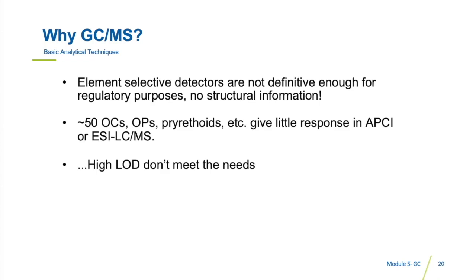Some pesticides can be brought into HPLC-MS methods, but challenges still exist for very low concentrations. The combination of GC with mass spectrometry has expanded the scope of use to confirmation analysis in a single method.